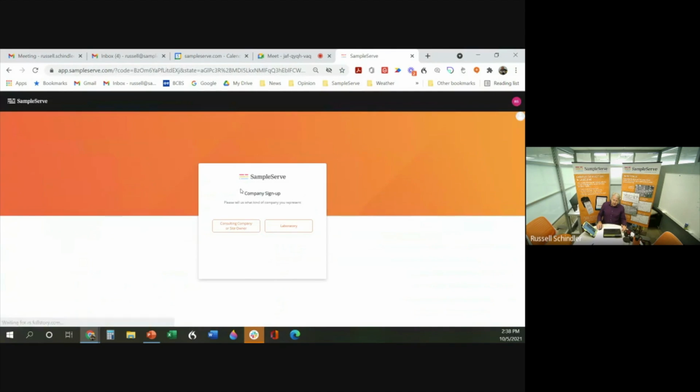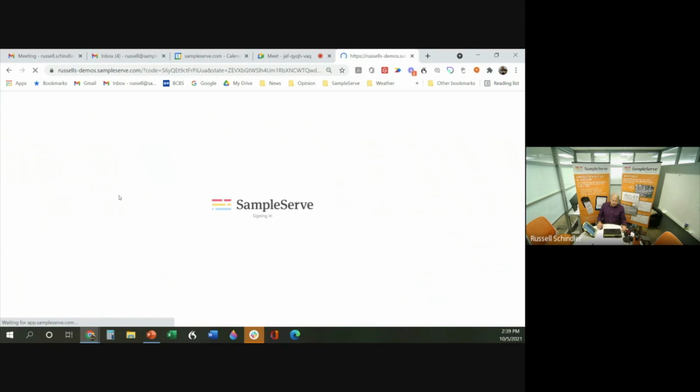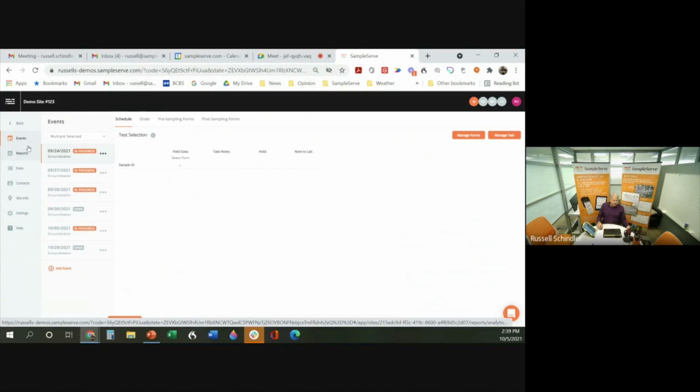So I'm signing in. You'll see a quick list of projects for me here. I'm going to quickly go to my project demo, Russell's demo projects, and you'll see here it's pulling up a couple of projects. I'm going to actually set up a scope of work here. We've got this demo project here. I can set up a scope of work. I'll do that last. I'm just going to walk through this thing for you.